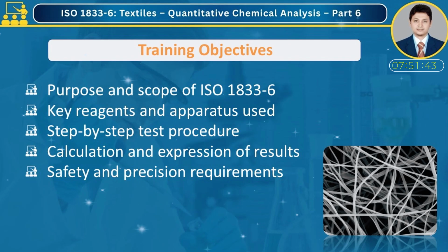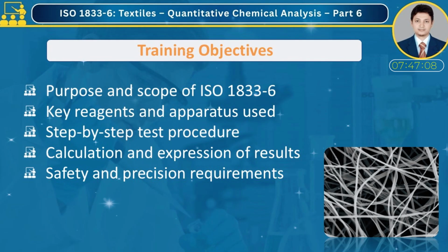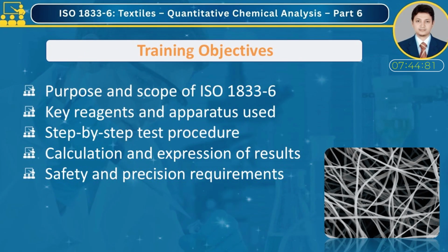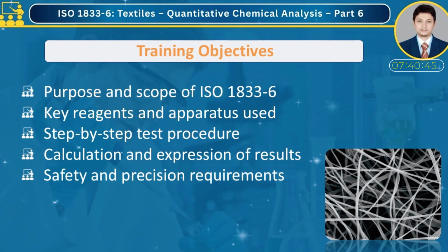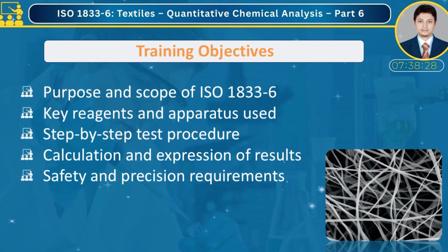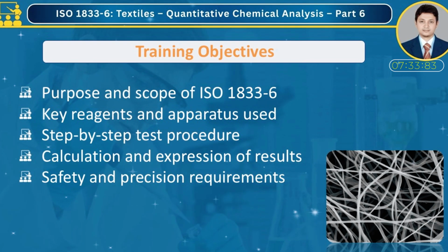You will learn about the scope of application, principles of the test, required reagents and apparatus, and the detailed step-by-step testing procedure. We will also review calculation of results, correction factors, and quality control practices to ensure precision and reliability of test outcomes.